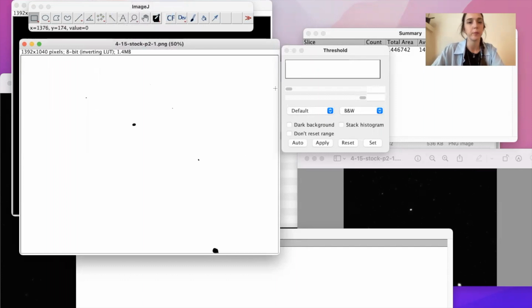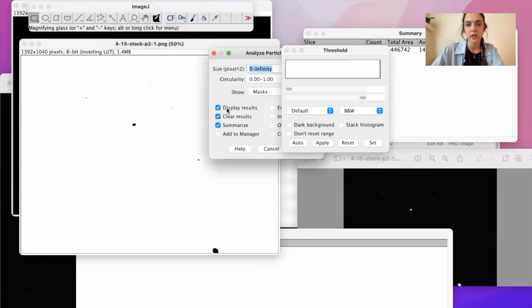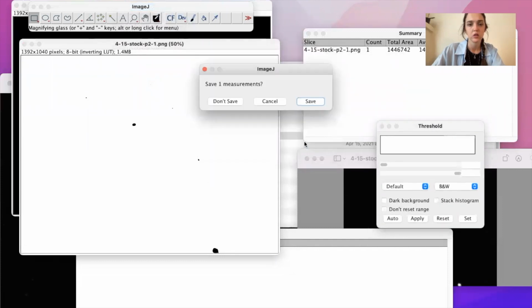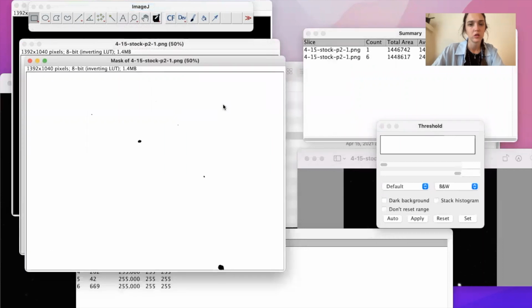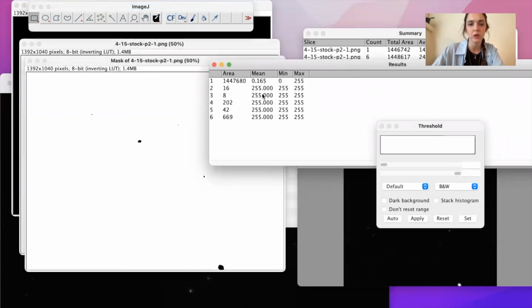Okay, I needed a white background. Let's try this again. Bingo, baby. Okay, here we go.